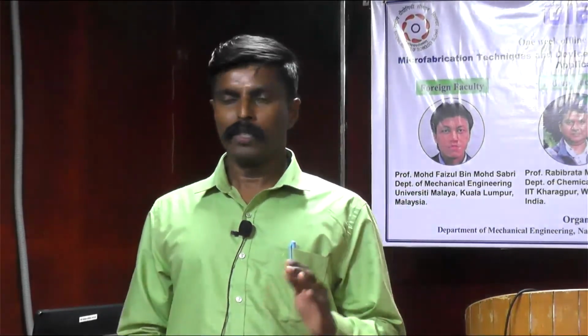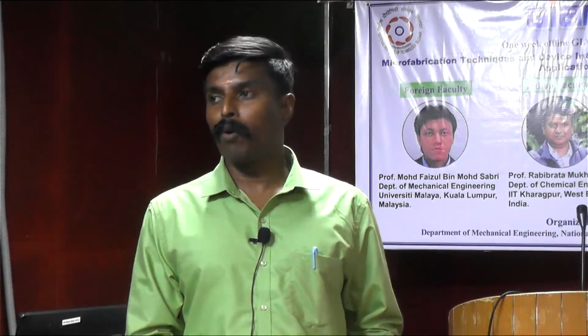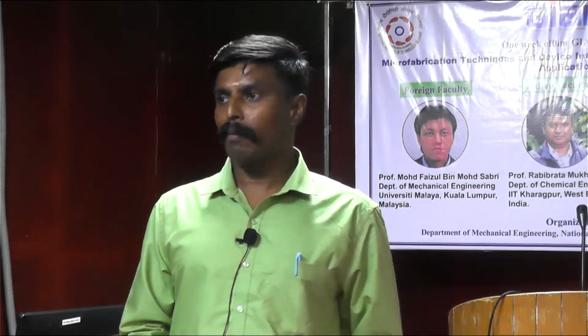Again, the failure analysis and fracture topography study by SEM. We have seen all this. Now we can understand that all these characterization techniques are involved; only then is it possible for a material scientist to design the material. It is the backbone of the materials laboratory.